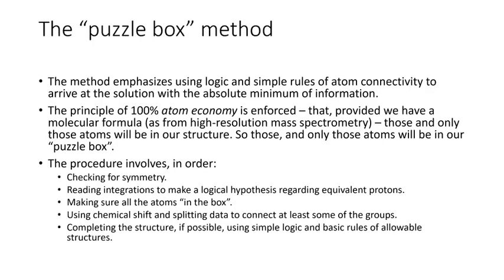The method emphasizes using logic and simple rules of atom connectivity to arrive at the solution with the absolute minimum of information. The principle of 100% atom economy is enforced. That is, provided we have a molecular formula, as from high-resolution mass spectrometry, those and only those atoms will be in our structure. So those and only those atoms will be in our puzzle box.